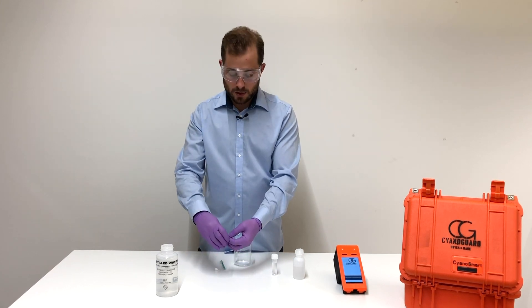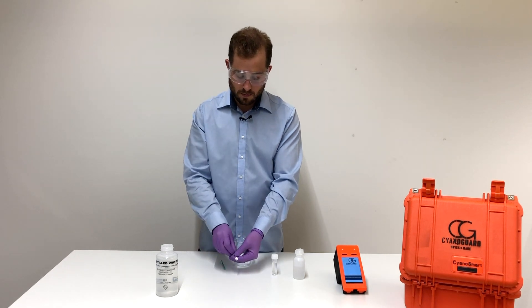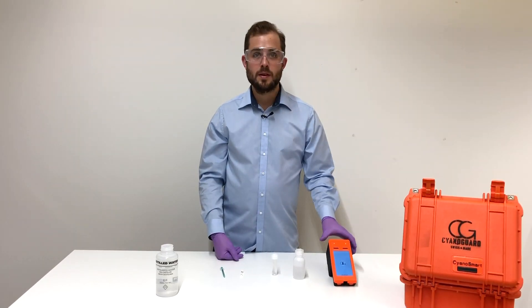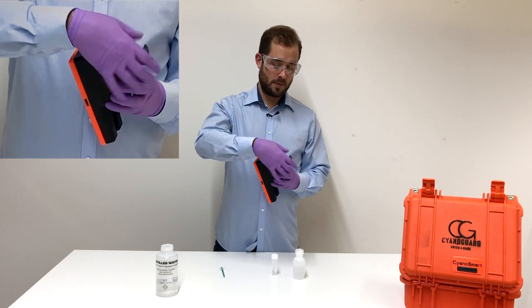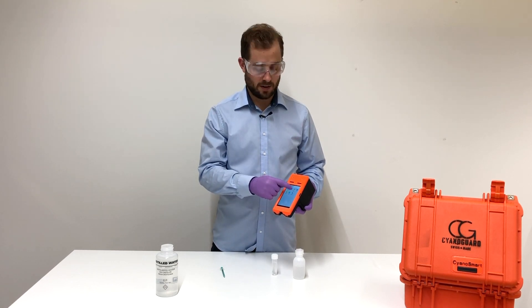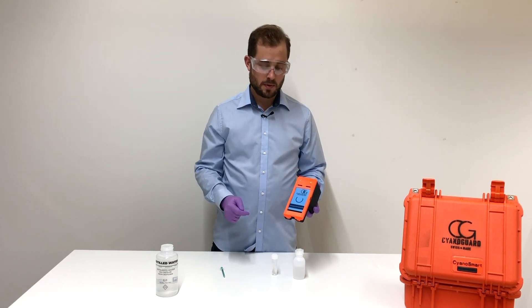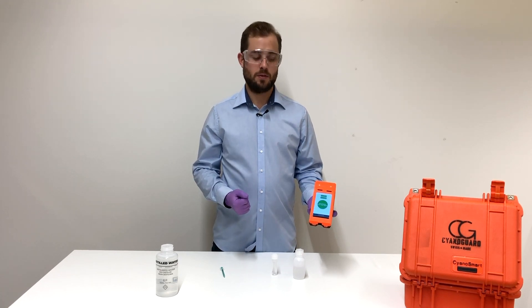Let's start the analyzer and insert the cartridge. On the analyzer, select the cyanide analyzer function and press measure concentration. In a few seconds, your result will be displayed on the device.